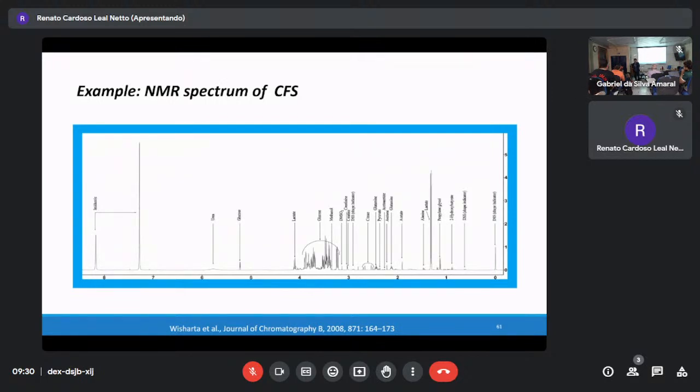Like plant hormone cases, maybe I can explain later. There are many methods. QTOF is the most common metabolic profiling instrument. Well, even if you have more money, obviously you can use it. But if you have a targeted analysis, like plant hormones, instead of coverage, I need sensitivity. In that case, a triple quad (TQ) also can be used, even better. Targeted.